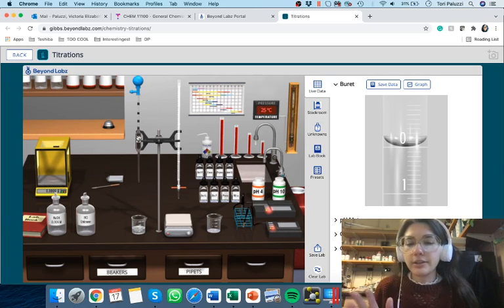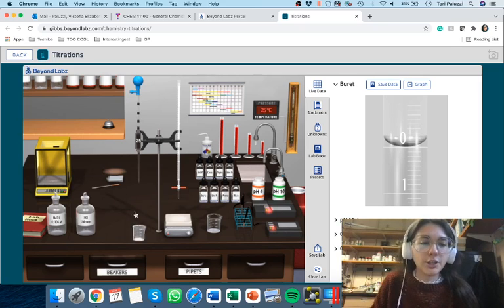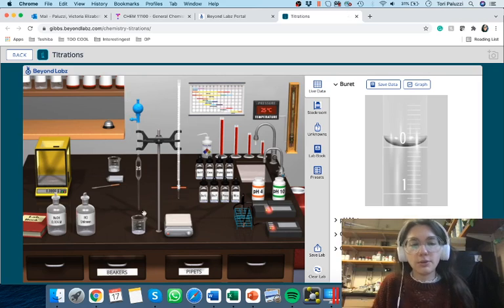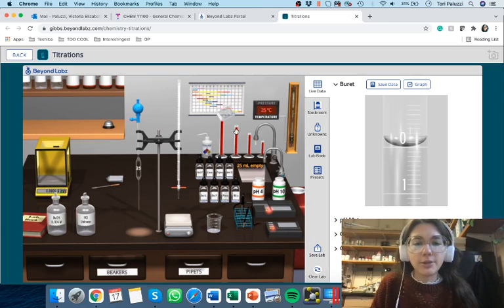And instead of clearing this bench and doing a bunch of stuff, if it works for you, wonderful. What you're going to do is you're going to tip this over here, you're going to pull this over here, and you're going to hit the bulb again, and it's going to spew that 25.00 milliliters in there. But for those of us, like myself, who've had this issue, I took this and I put it over my 25 milliliter volumetric, and eventually it will take.